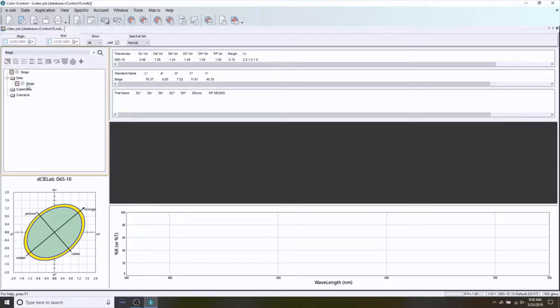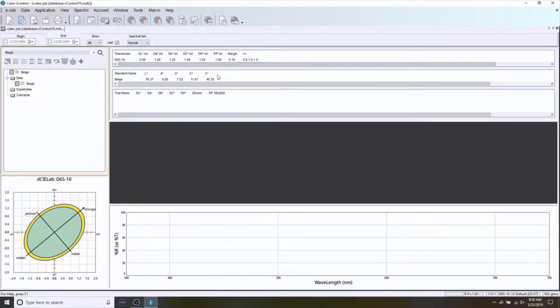It maintains that target icon indicating a standard or target that you're trying to achieve. We can see its colorimetric data here — LABCH — identifying the color of that standard. And right above, we can see the tolerance that I have set. In my particular case, I have a pass-fail tolerance of 1.00 in Delta E 2000.